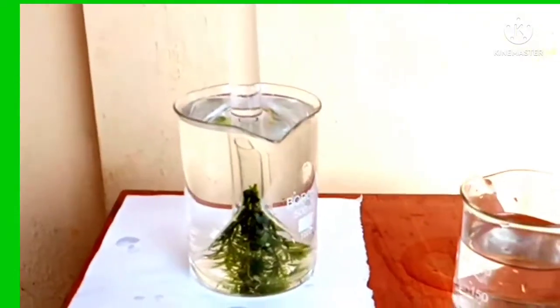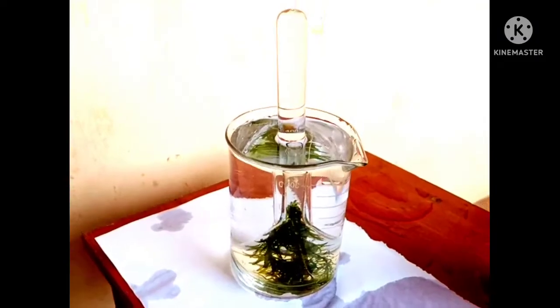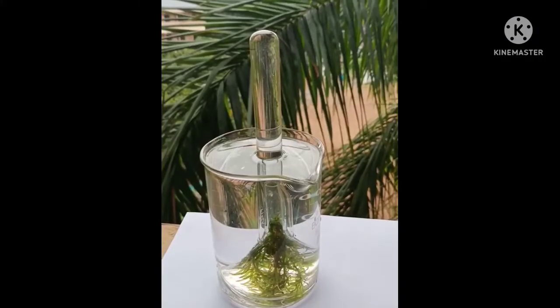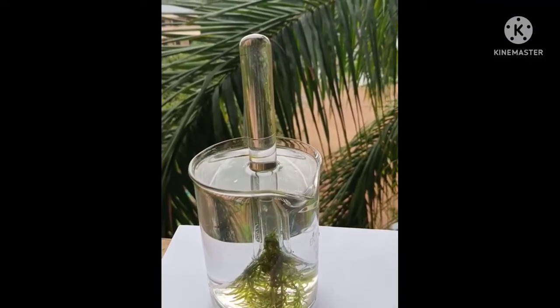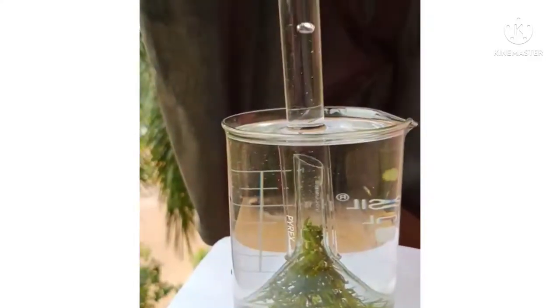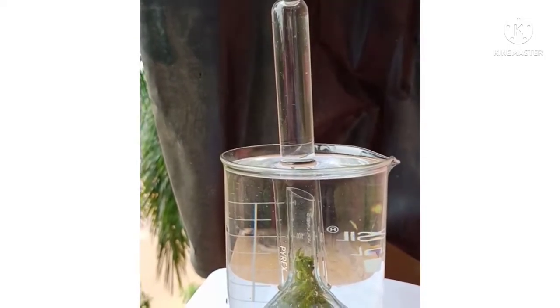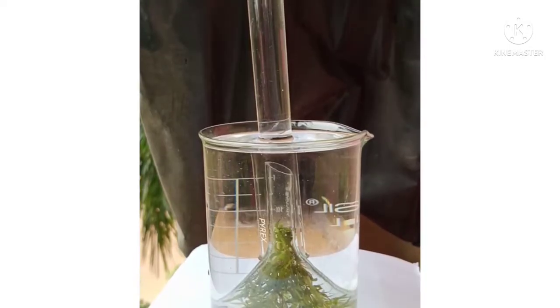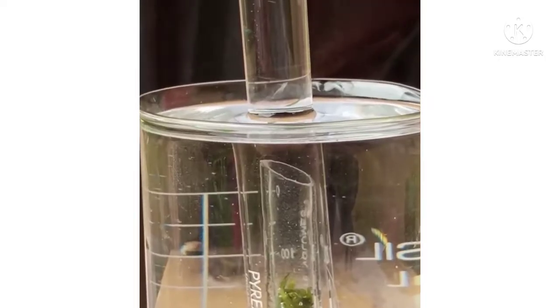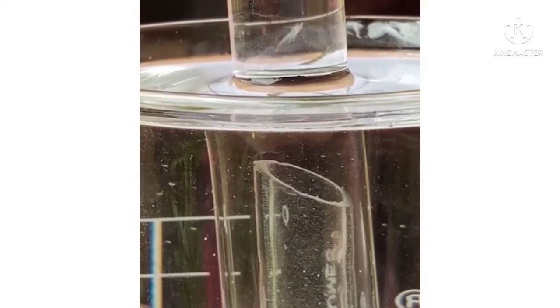The apparatus set up is now ready and is placed in sunlight for a few hours. We can observe that air bubbles are seen to come out of the cut ends of the plant. These bubbles are collected at the top of the test tube by the downward displacement of water. The gas on testing is found to be oxygen.